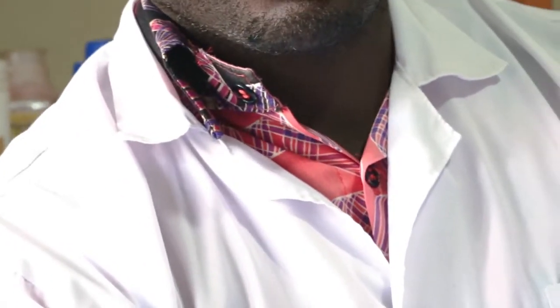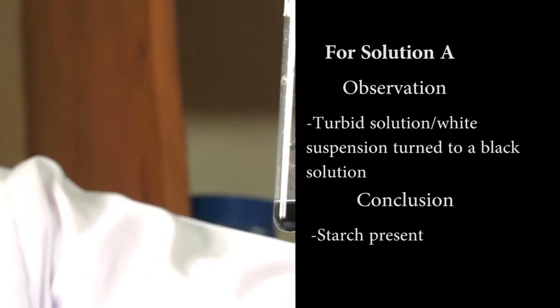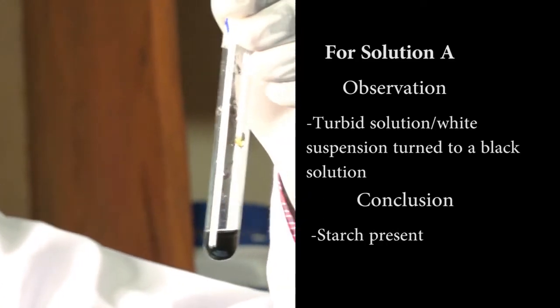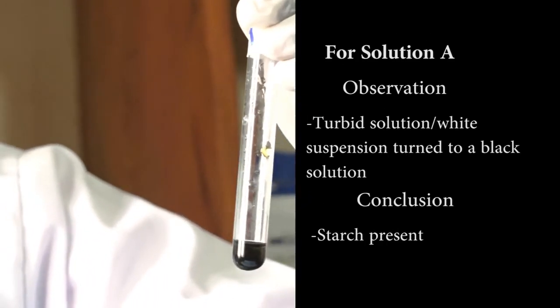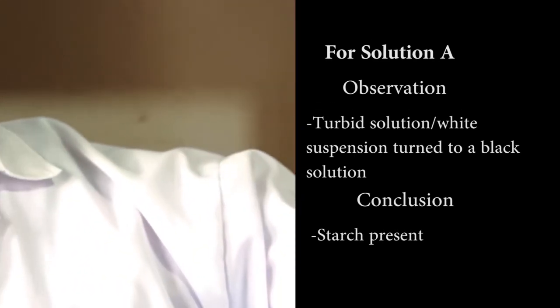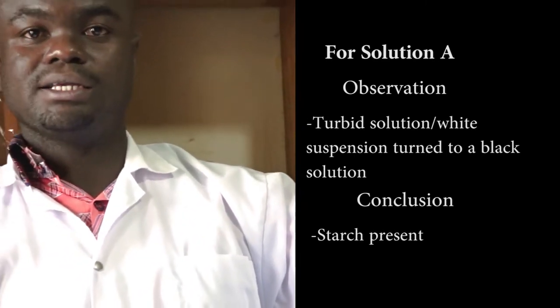We have our final color and you can see it is black. So in our observation we are going to say the turbid solution turned into a black solution. And in our conclusion we are going to say starch present.